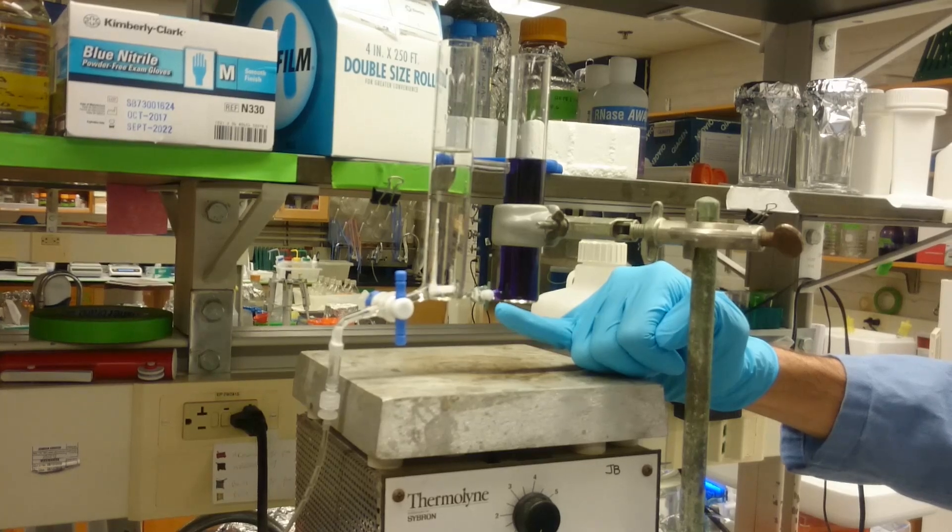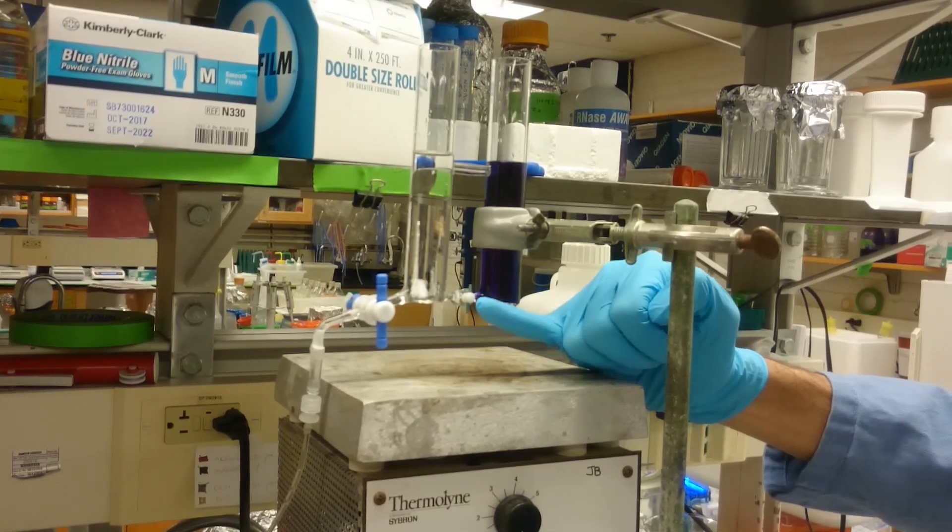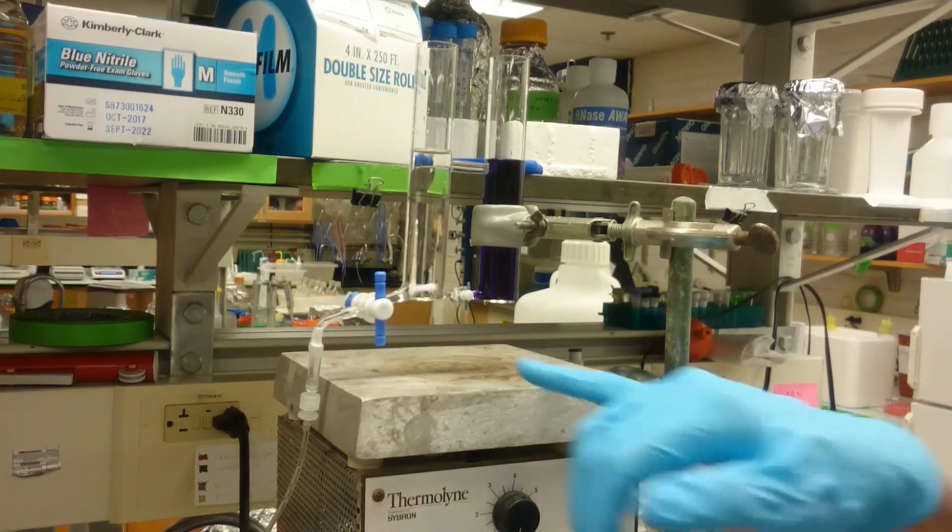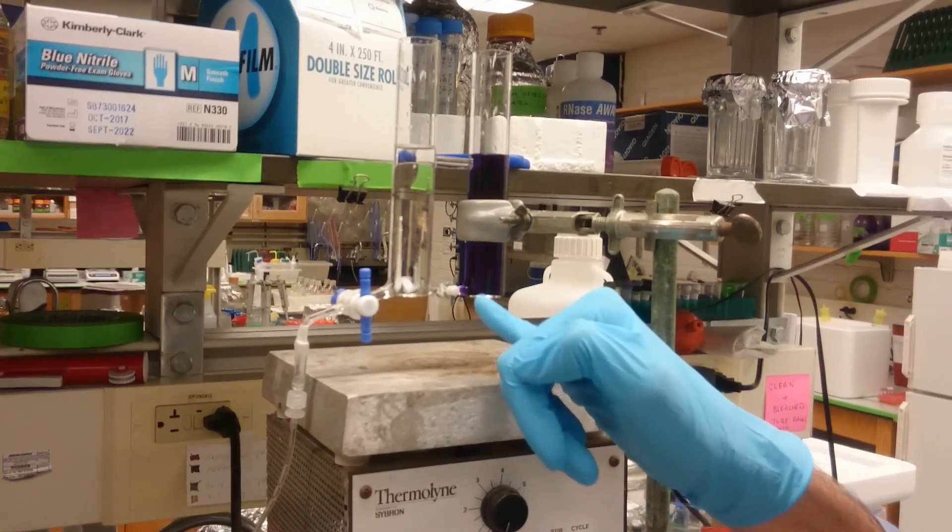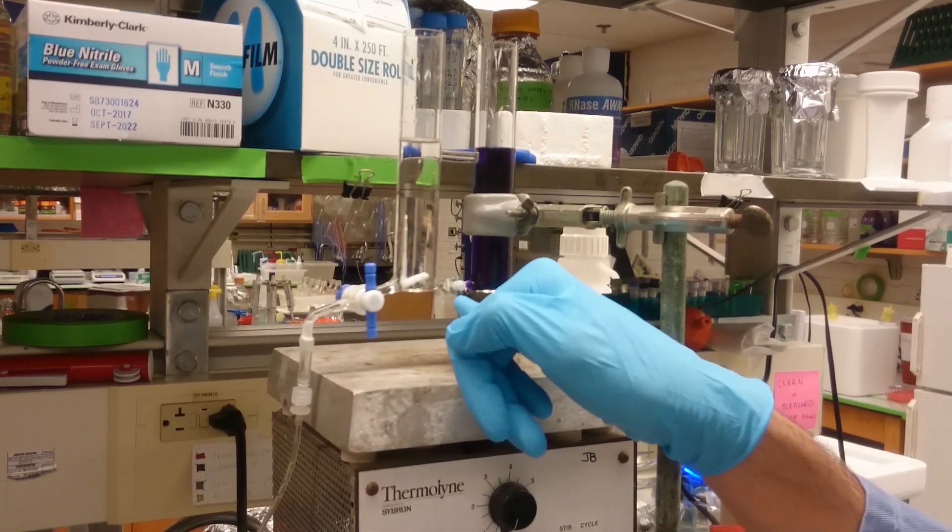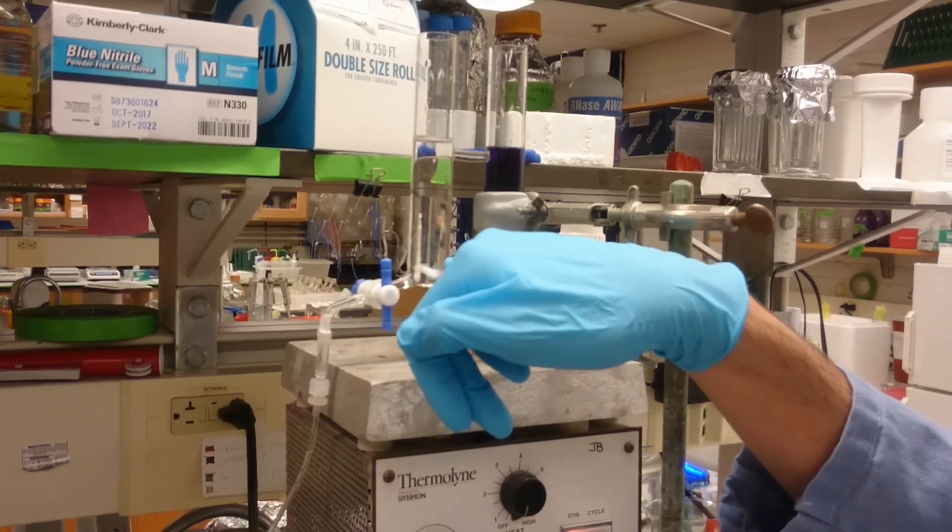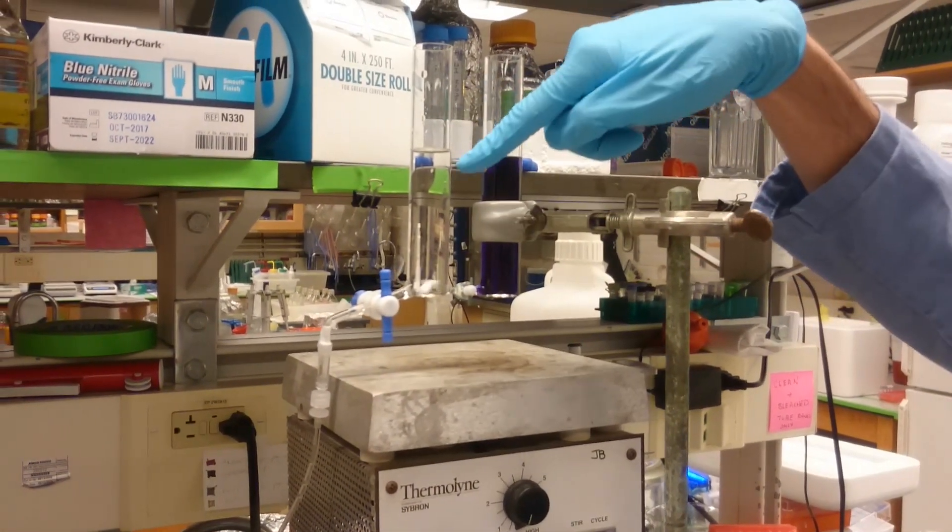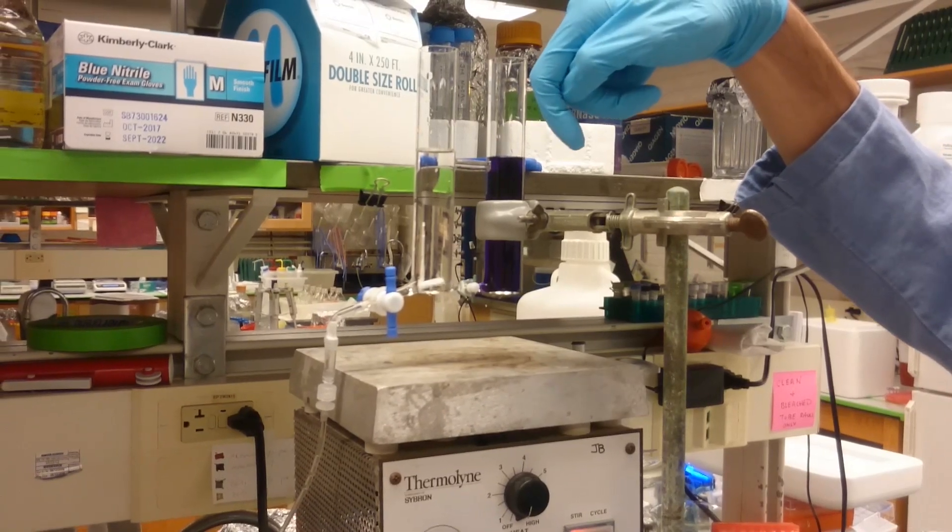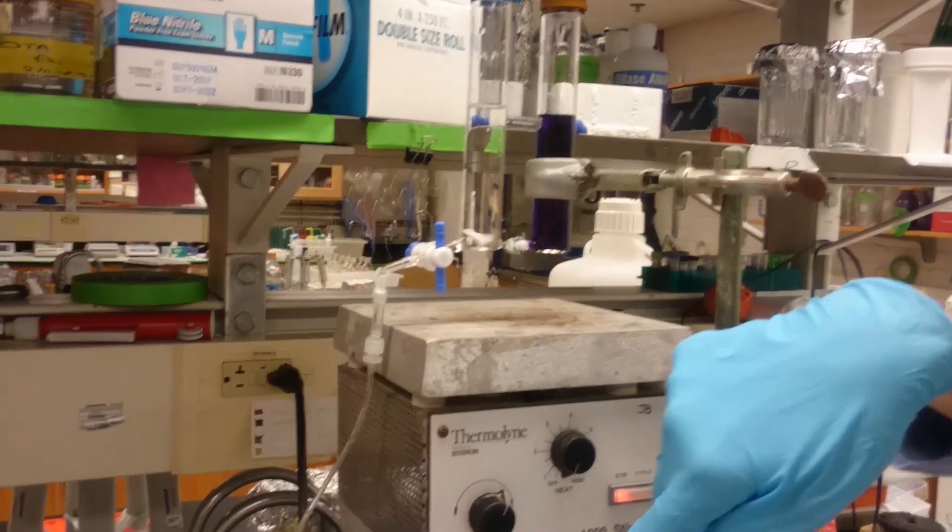In between there's a small connection that is sealed at the moment using this small stopcock, and then a stir bar in this chamber here. As you start to run this column, you'll open this small stopcock, liquid from here will start mixing into this larger volume, and over time it'll have a higher and higher percentage of the ending buffer in this chamber which will then go to the column.